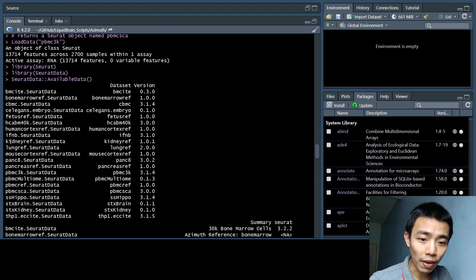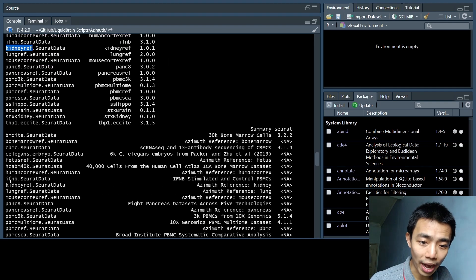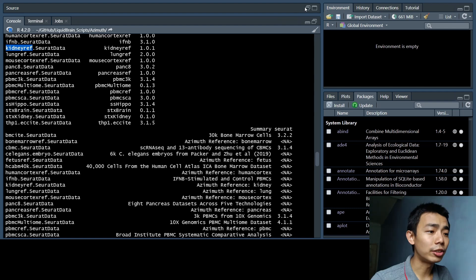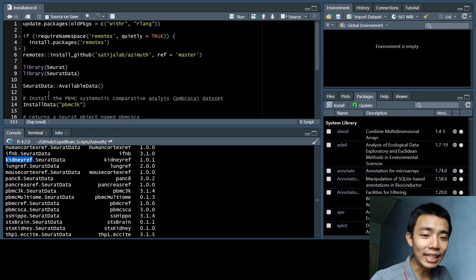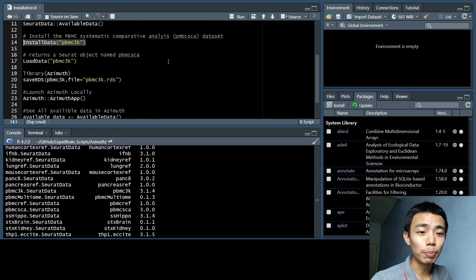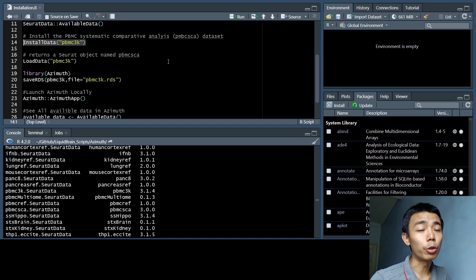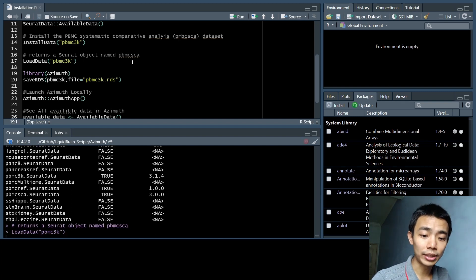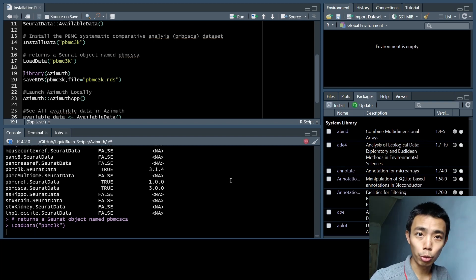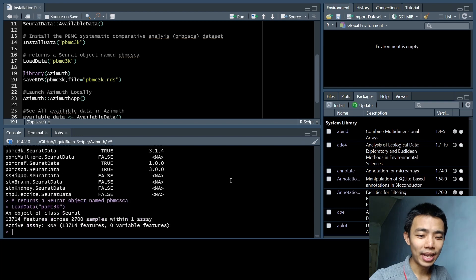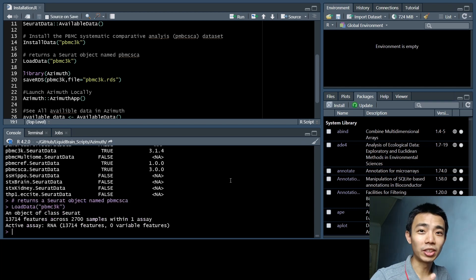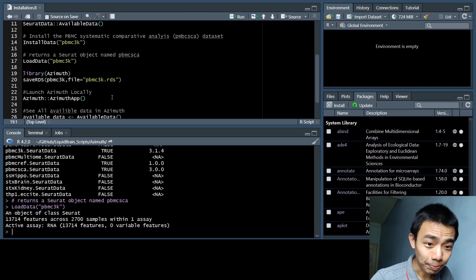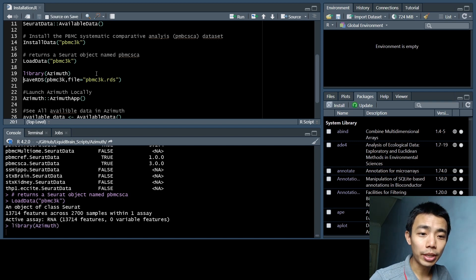After you've done that, you can go and load your Seurat and SeuratData library into R environment, and you can have a look at what data is available in the SeuratData library. When you actually install the package, because the dataset is actually quite big, it doesn't automatically download all the dataset onto your own computer. They just give you an index on where to download them. For example, if I want to do kidney references here, or I want to do IFNB, I actually have to install those data, which will actually pull the data from their server onto my computer.